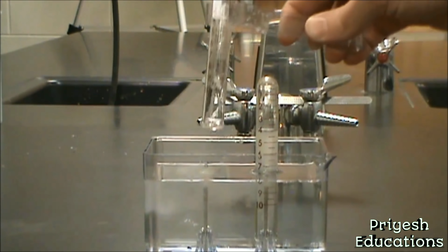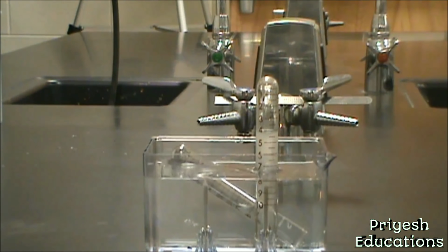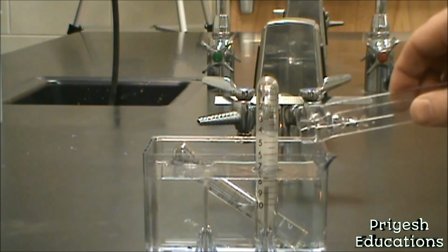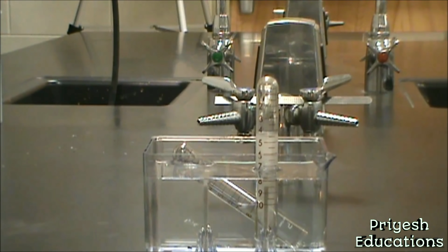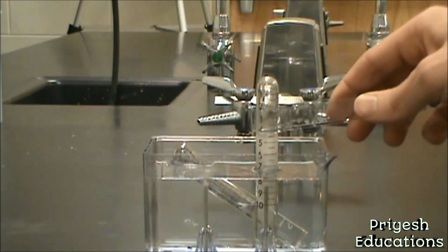Okay. And so from that noise, we know that we have hydrogen gas present. So now we want to do a test on the other one to see what gas is present over there. And keep in mind that we're only testing about a half-filled container here, so we're up to about 4.5 milliliters of this other gas. What we're going to do here is test to see what this is.